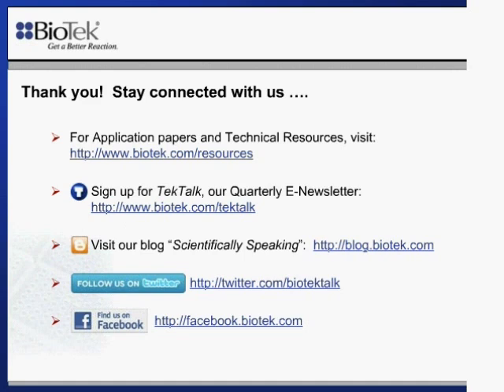Which leads to the next question. We are experiencing high variations in protein quantification using Take3 Epoch, getting negative values, and do you think the RIPA buffer used for diluting proteins would be the problem? And indeed, that probably is causing some interference, especially if you're using that as a blank.